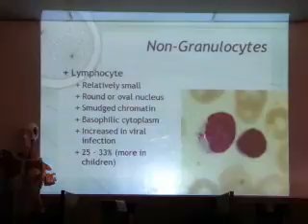And you can see from this slide, there are some purplish inclusions in the cytoplasm. So these cells can have things inside the cytoplasm, but we don't call them specific granules. Okay? Specific granules are only those we consider to be basophilic, eosinophilic, or neutrophilic. These other ones, we have other names for them, but we don't consider them the same as granulocyte granules.